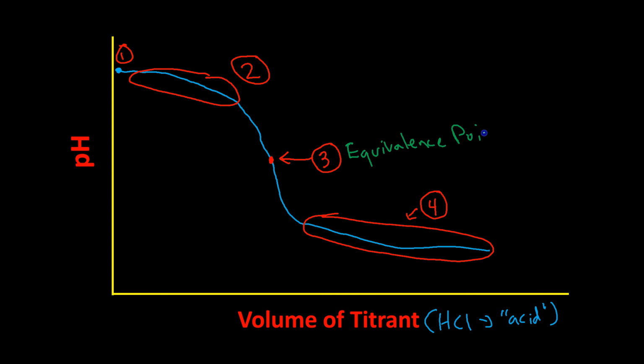Everything can be thought of in terms of whether we're before or after the equivalence point. I'm going to talk a little about what controls the pH during this process. If we haven't got to this point in class, things might be a little unfamiliar. You don't need to know how to calculate all these pHs at this point; later in the class you'll be expected to know it, but right now I just want to give you context for what's going on when you perform this titration. We'll go through these step by step.